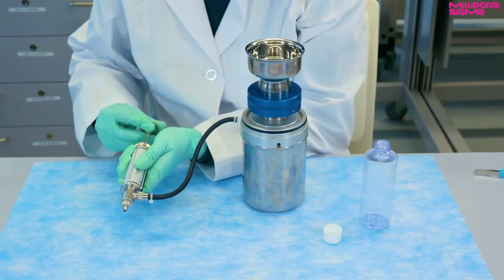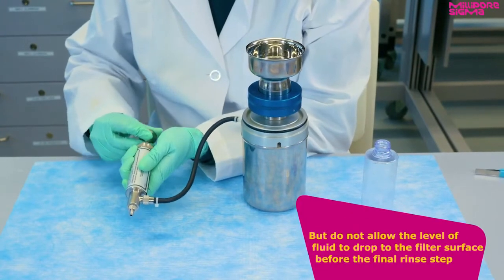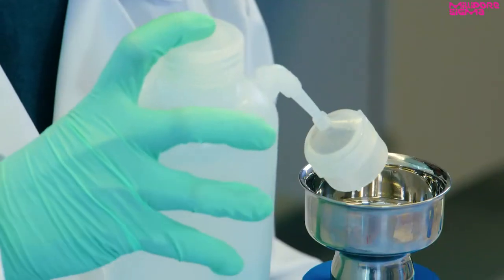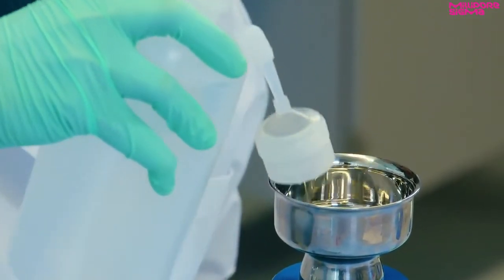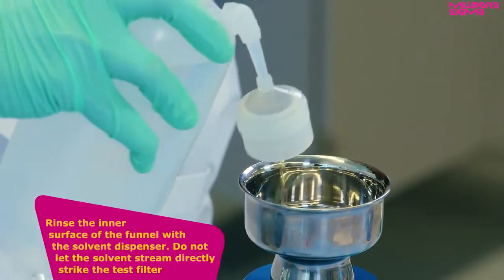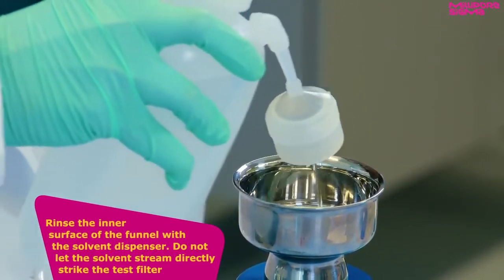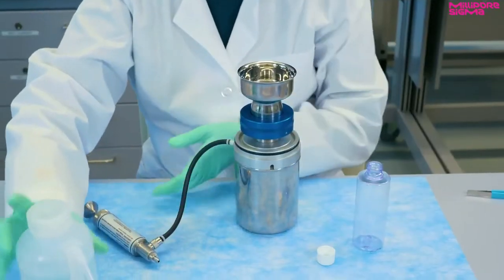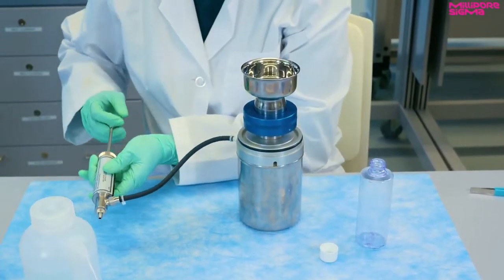Operate the syringe again if necessary, but do not allow the level of the fluid to drop to the filter surface before the final rinse step. When the sample level in the funnel drops to the narrow neck of the funnel, rinse the inner surface of the funnel with the solvent dispenser. Do not let the solvent stream directly strike the test filter. Continue filtration until all the fluid has passed through the filter.